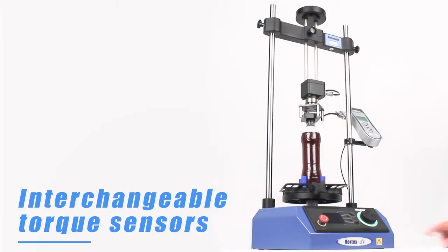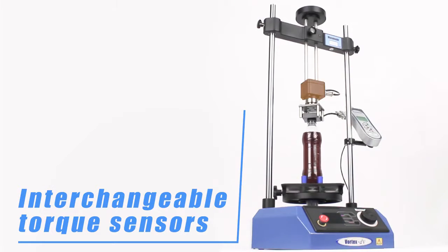Torque is measured by one of four interchangeable torque sensors, which the AFTI display can show in either metric or imperial units as you require.